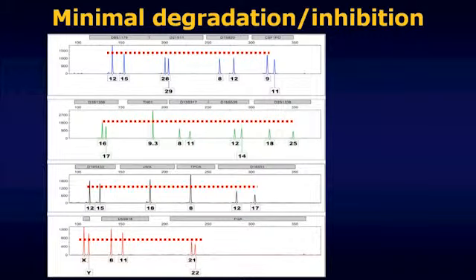And the key here again is that from left to right, that line is flat. Those peaks have about the same size. But remember, when we're looking at electropherograms like this, the smaller pieces of DNA are the first ones that come off the capillary during capillary electrophoresis, the size fractionation that takes place in a genetic analyzer. Those are the ones that come off first, the small ones.